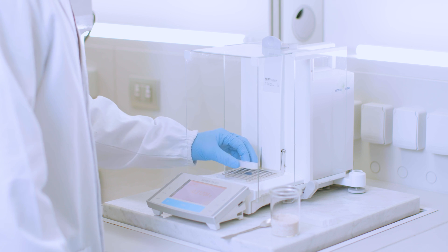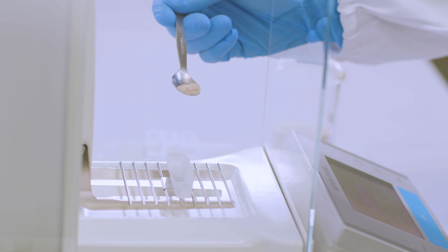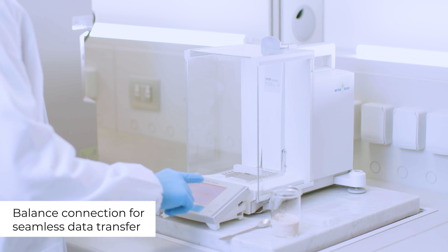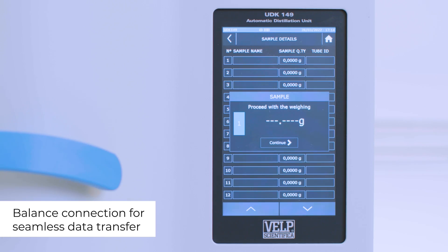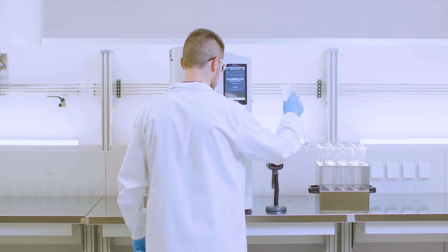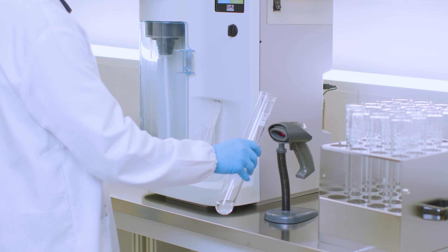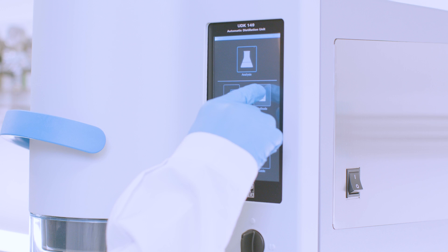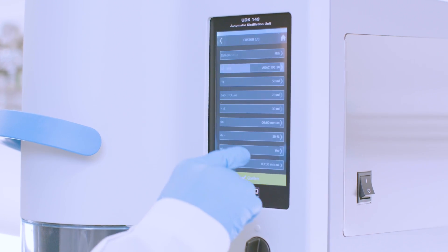To start, homogenize the sample and transfer it into a VELP test tube. Connect the UDK 149 to a balance for seamless data transfer. The optional barcode reader simplifies data management and speeds up the analysis preparation, avoiding transcription errors. Create a new method following the guided procedure.